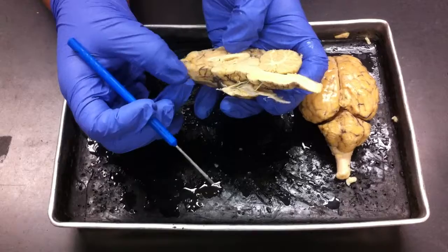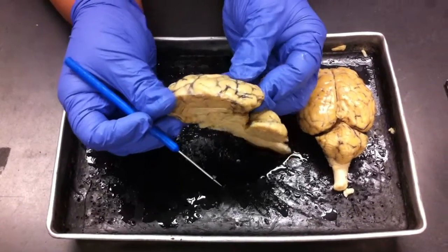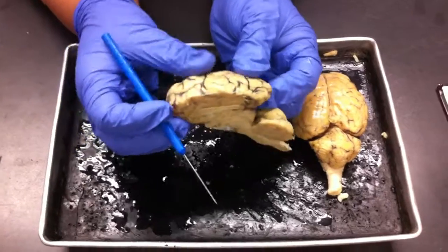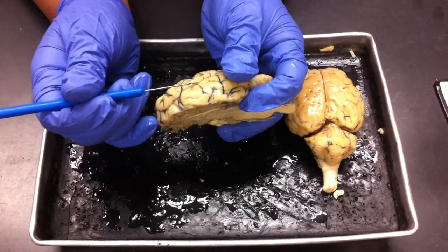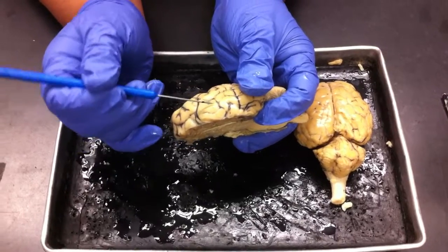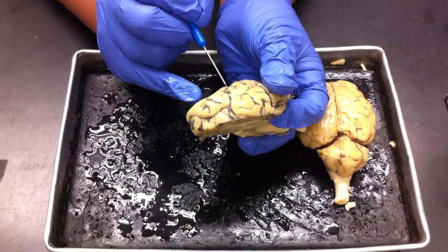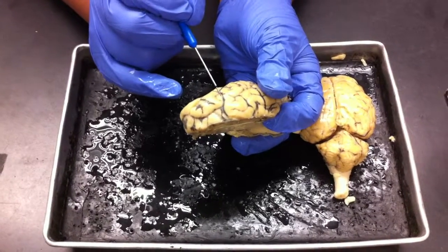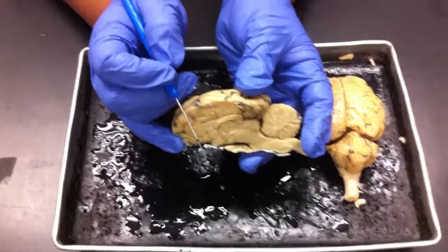This thin little covering that looks like mucus is the pia mater. And just in general, anytime there's a depression, it's called a sulcus, and elevations or folds are the gyri, or gyrus, meaning individual or single. That's it. Thank you.